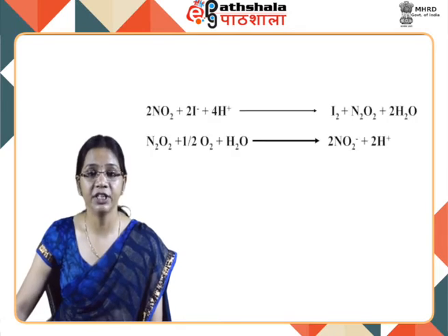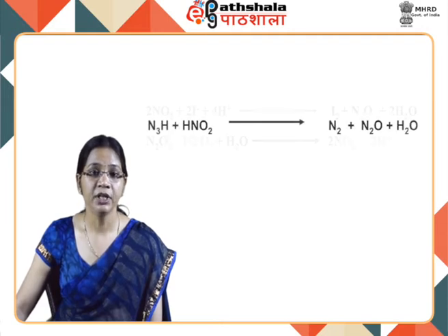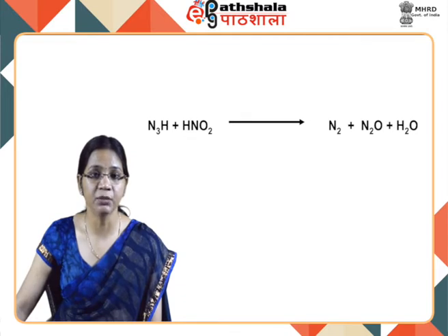Nitrite interference and azide modification. Nitrite in a water sample causes interference by oxidizing iodide, as nitrite plus iodide will give N2O2, which is then oxidized by oxygen entering during the titration. It results in an enormously high value and the endpoint cannot be detected. So, it may be eliminated by addition of sodium azide to alkaline solution. On acidification, NO2 is decomposed, as you can see in the equation.